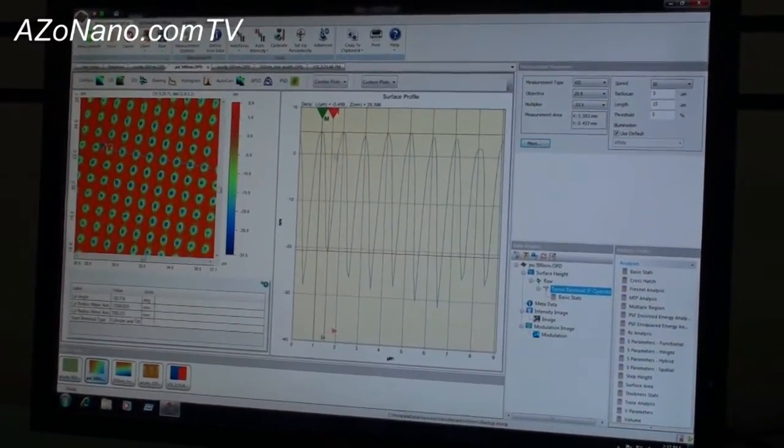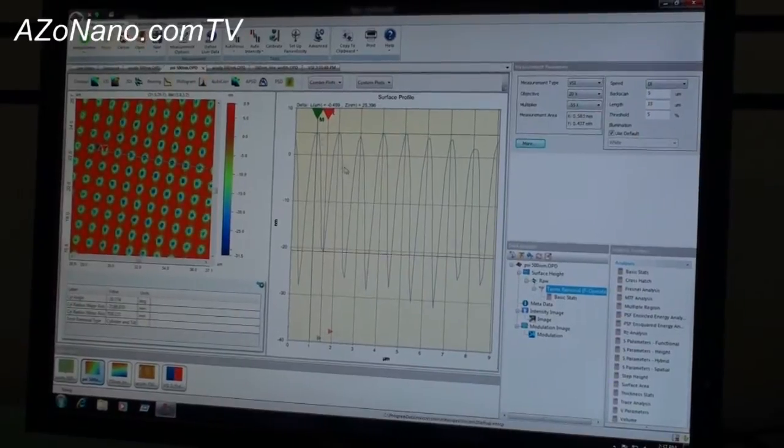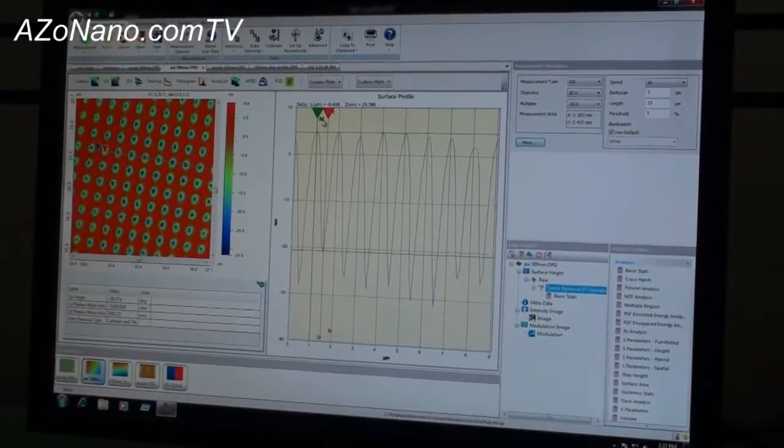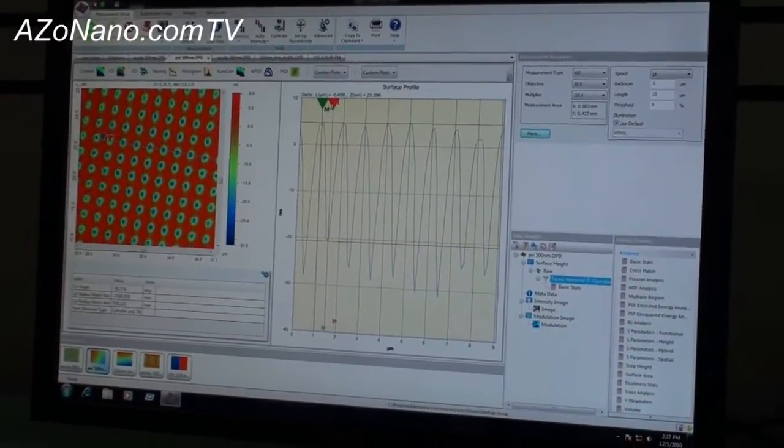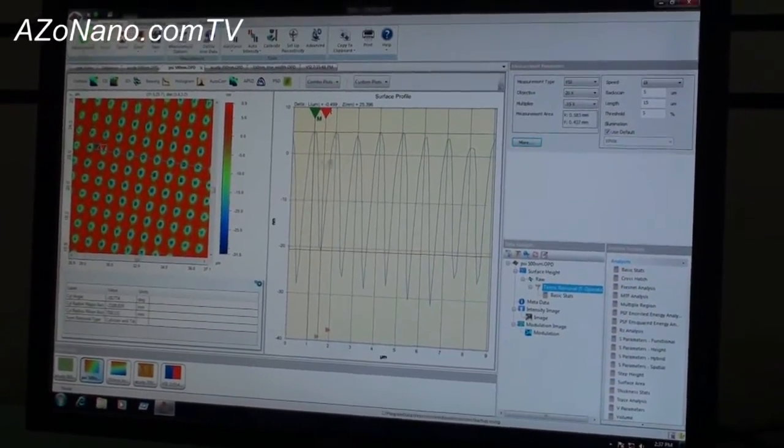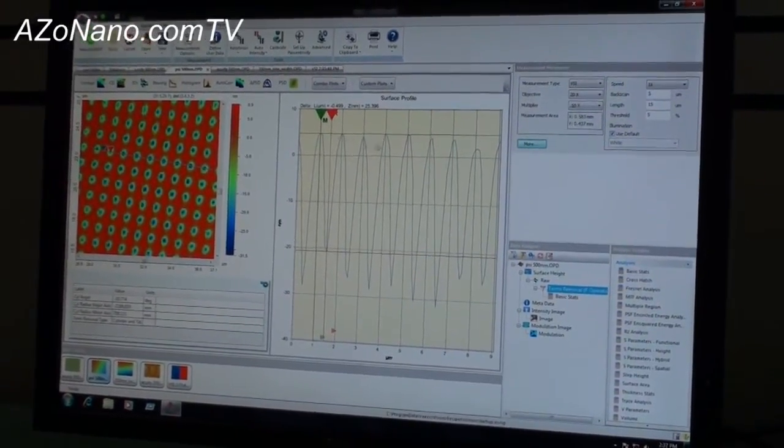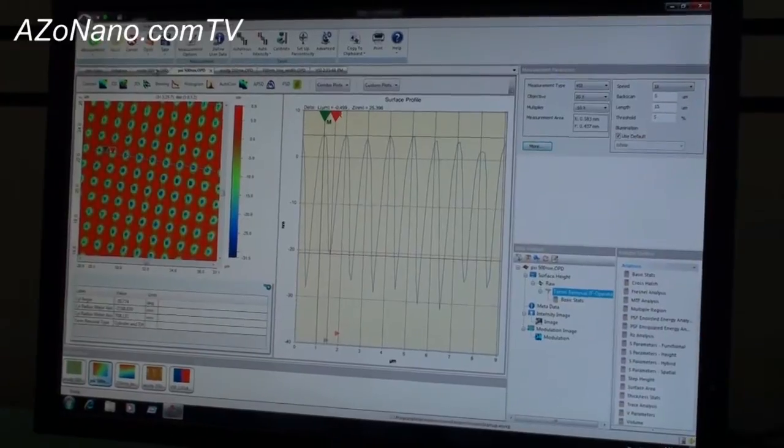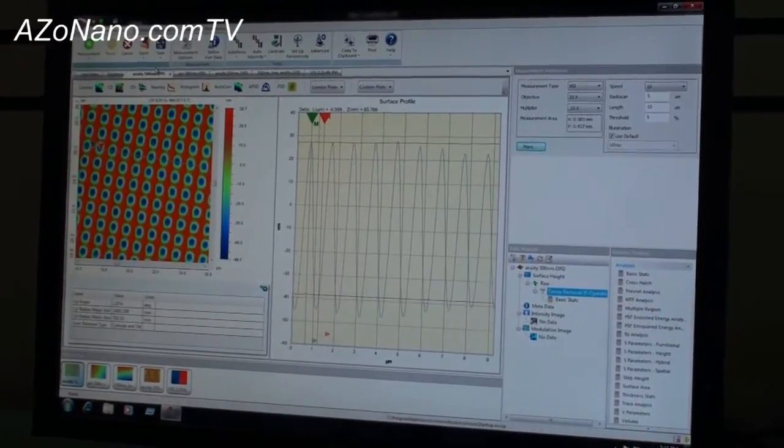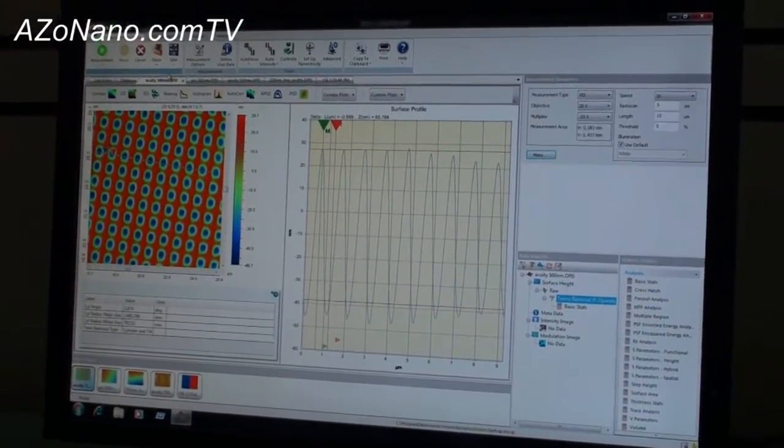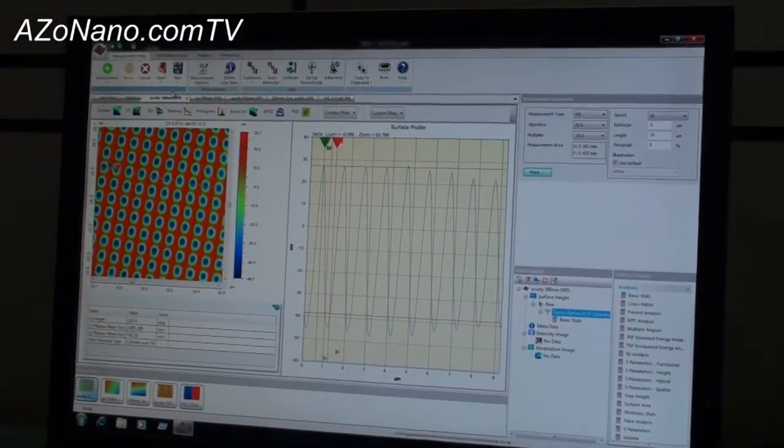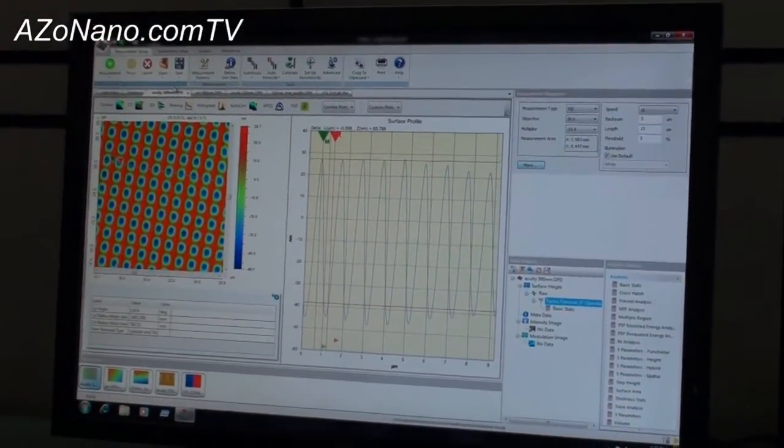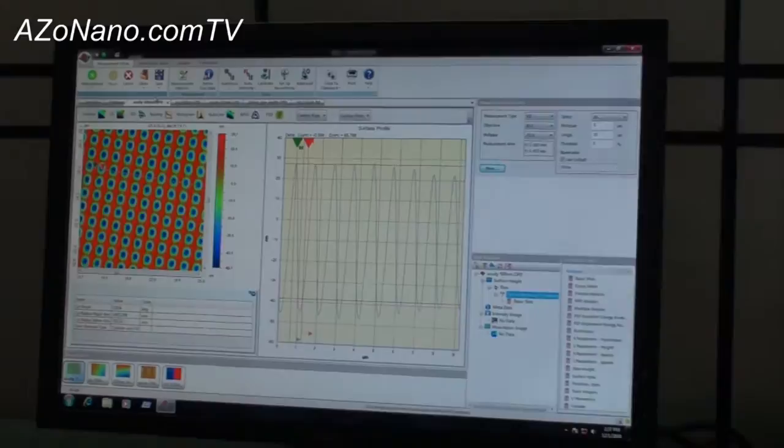If we go back and look at something done with the standard phase shifting interferometry, you'd see it's chunky and pixelated. Here we see it's very smooth and gives us a real nice representation of what these pits look like.